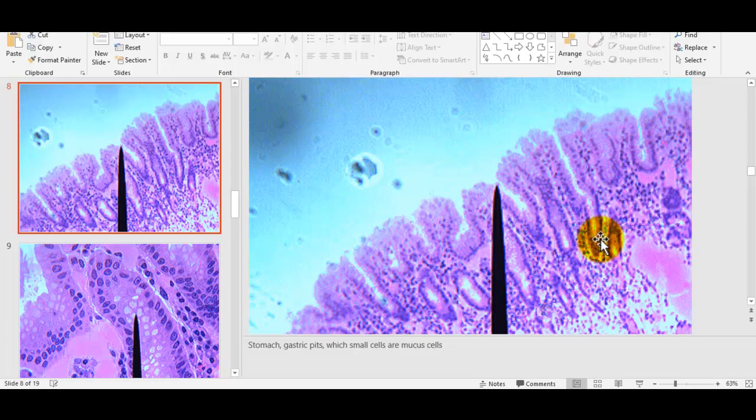And what you have in here are different cell types. And the opening to these glands, the openings here, the openings in there, are called gastric pits. That's the opening to, and a gland is really this, like I said, it comes down. There's one that is shorter, so it comes down, turns around, then comes back up this way. So those are gastric glands.